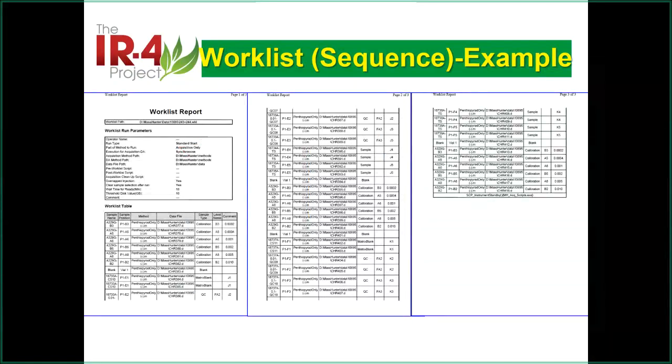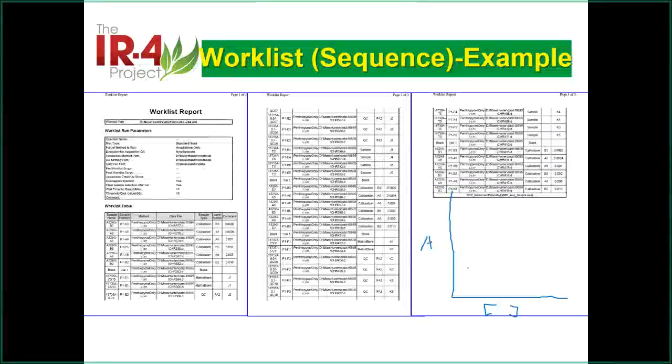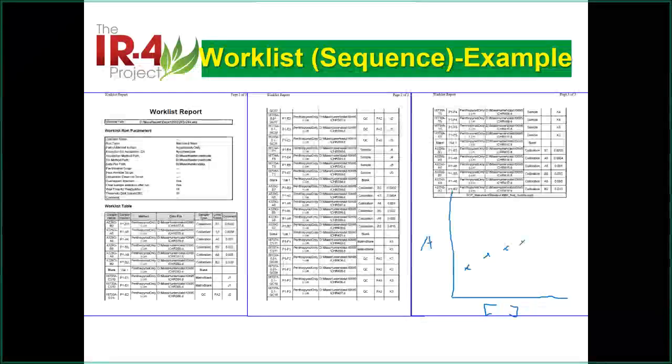Yes, we do see this thing. For example, this is the calibration. This is the concentration down here, and this is the peak area. Okay. Then this is set 1. Let's say we put dots there, set 1. That's typical, something like that. Not necessarily a straight line, but it's good enough.